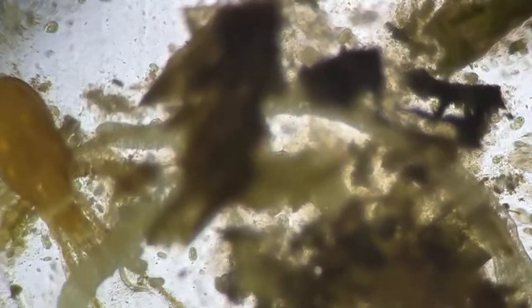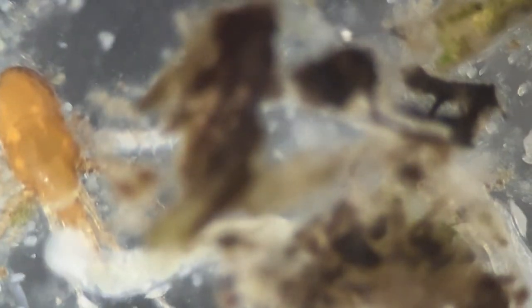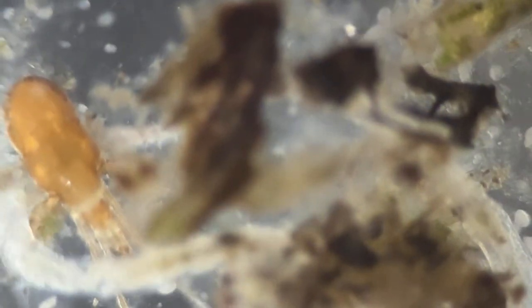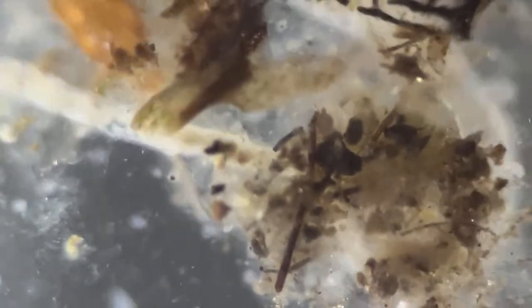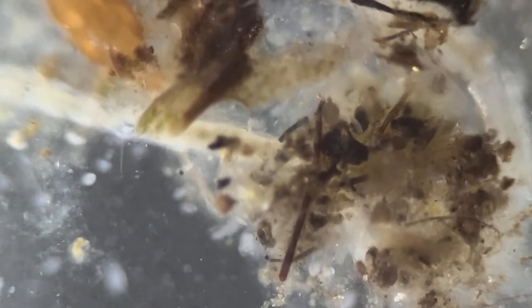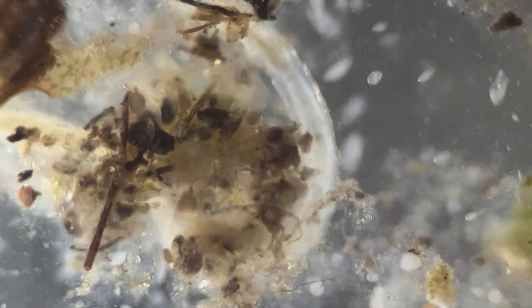But when I put off the microscope's light and let this torch's reflective light come, I suddenly get a very rewarding experience. Not like an X-ray, but more like the real world. Let the worm come out of this debris, because I had observed its heartbeat as well.